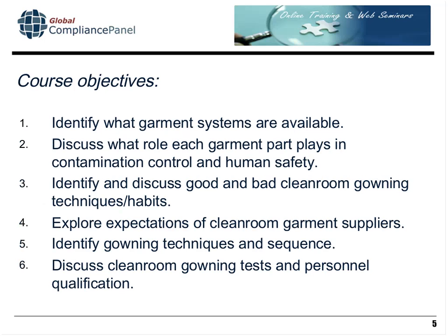Our objectives: first, we'll identify what garment systems are available for those working in or responsible for a controlled environment. We'll discuss what role each garment plays in contamination control and human safety, as there are two different roles. We'll identify and discuss good and bad cleanroom gowning techniques and habits — it's not just about having the right tools, but knowing how to use them. We'll explore supplier expectations for cleanroom garments, identify proper gowning sequences, and discuss cleanroom gowning tests and personnel qualification to ensure people are doing what they're supposed to do.